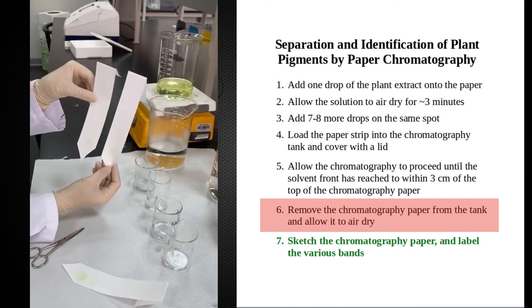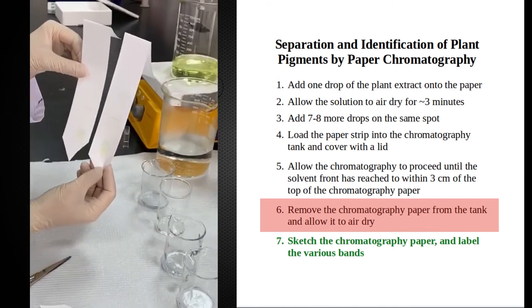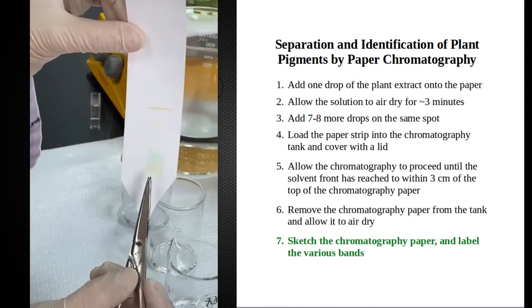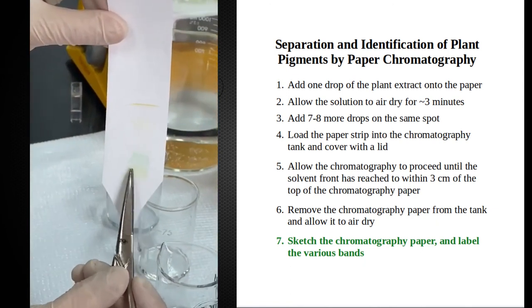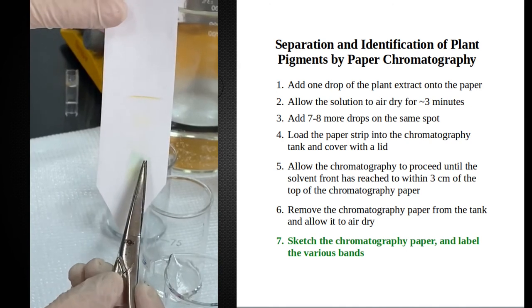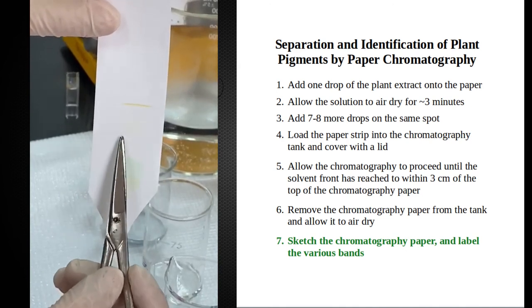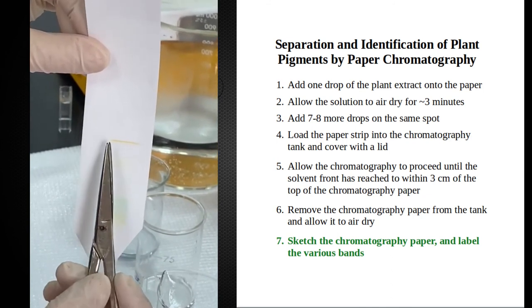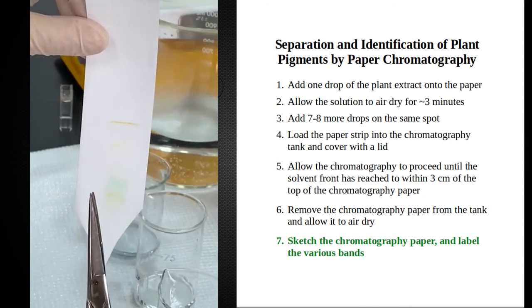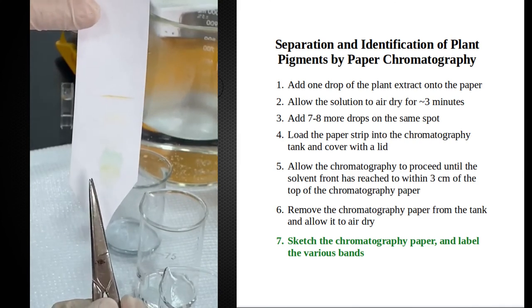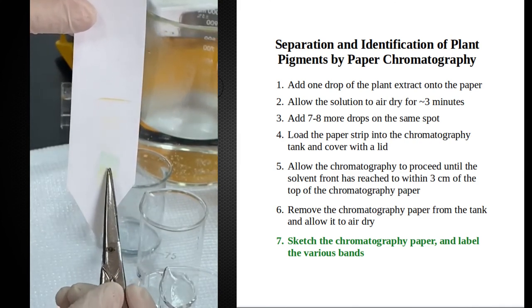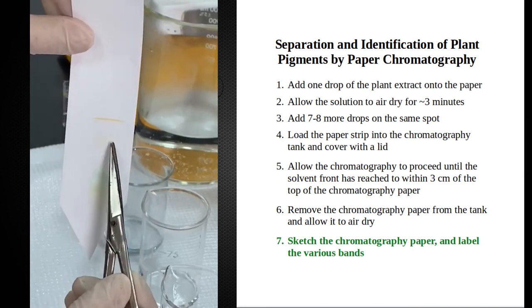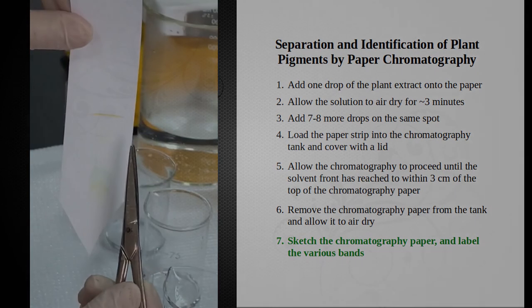These are my papers after separation of their main pigments. What we have obtained is four different colors: this is chlorophyll B, olive green; this is chlorophyll A, bluish green; this is the xanthophyll, yellow in color; and this is the carotene, which is orange in color. The most polar is the chlorophyll B, it remains all the way down. The most non-polar is the carotene, which travels all the way up with the solvent.